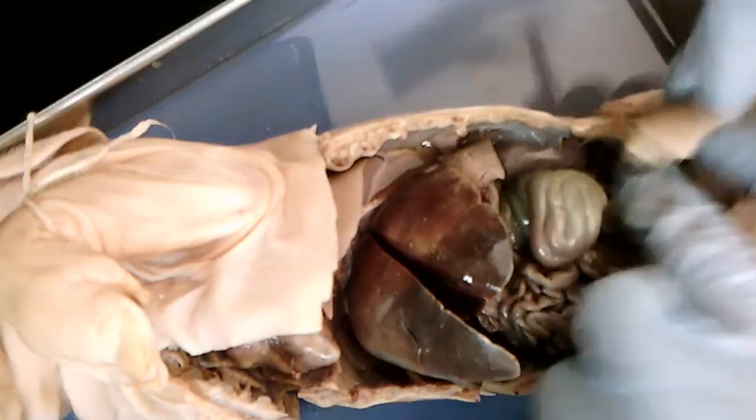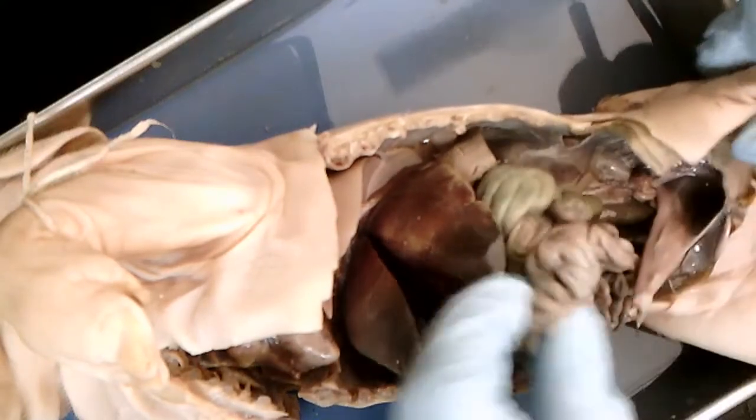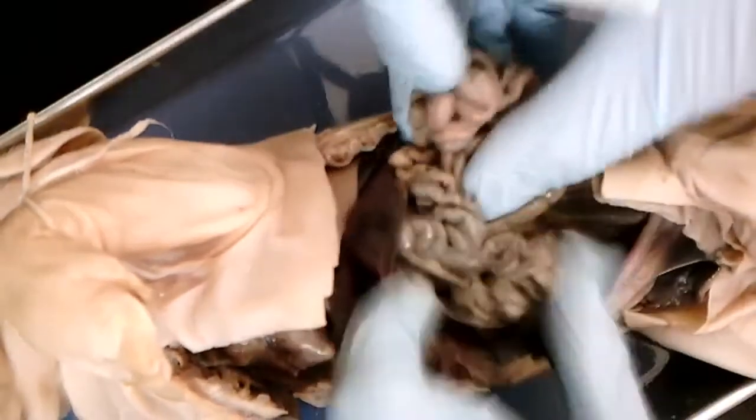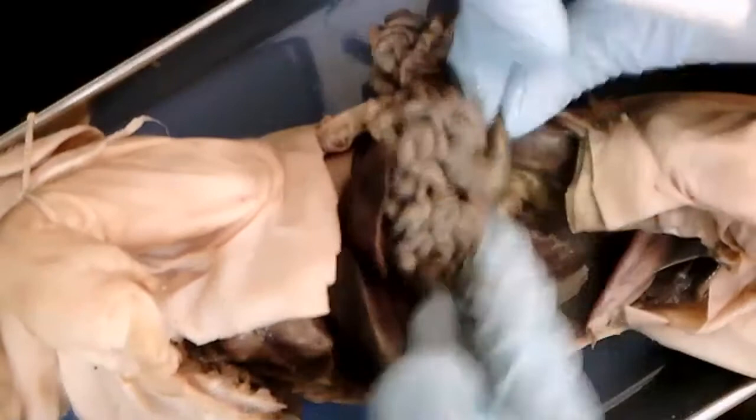So what's nice about this handout is it kind of gives you instructions on where things are. Because the cecum is sometimes hard to find for me anyway. It's just not too big on a monogastric. No. Unless you're a horse.